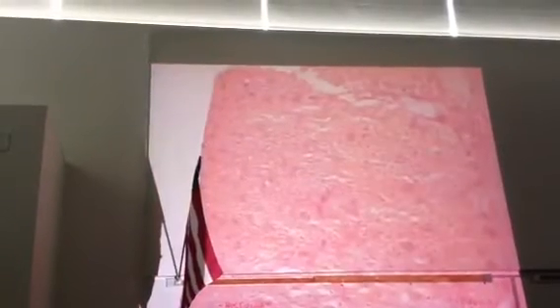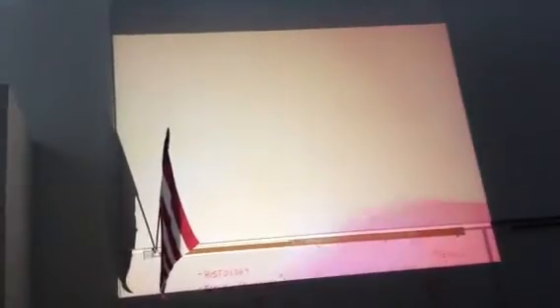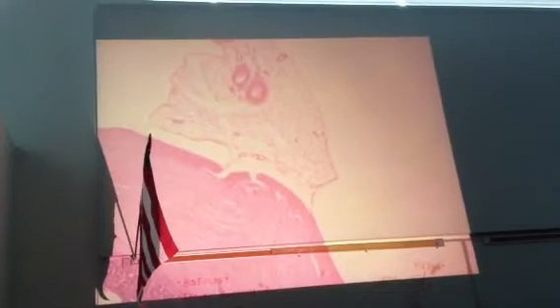And here the muscle cells are going in and out of the plane of the board. And we see the dark profiles of those muscle cells. And the outer layer is the serosa. And there we see that serous membrane. Now, that was jejunum. Oh, I didn't go all the way around. Let me do that.